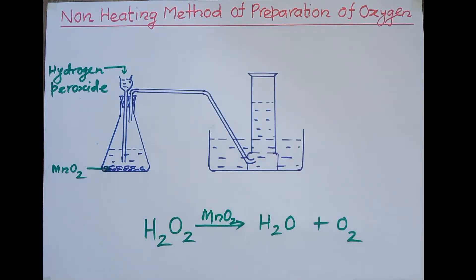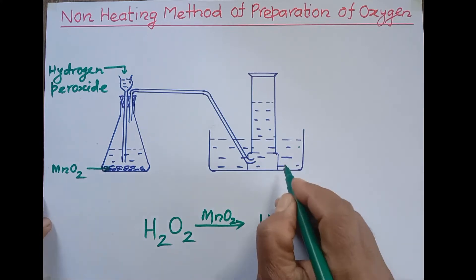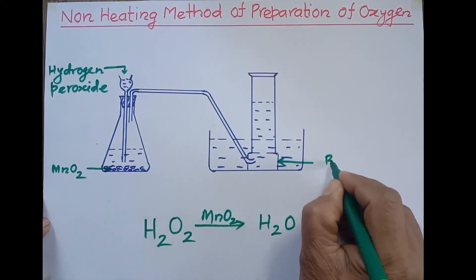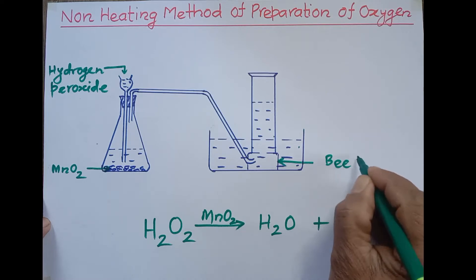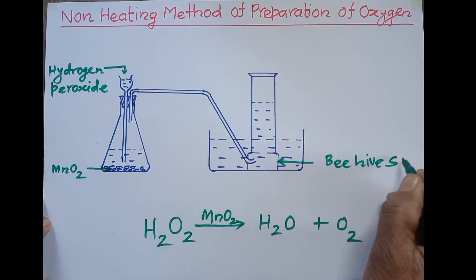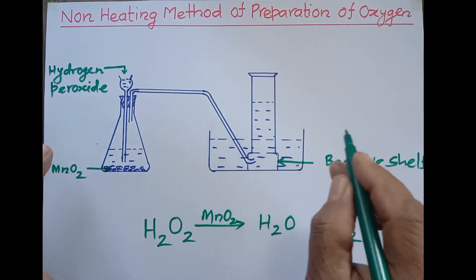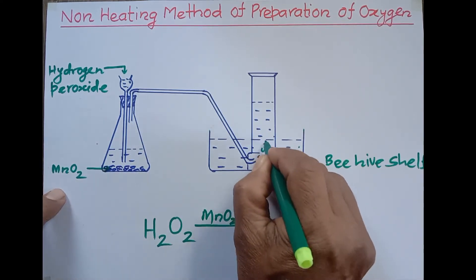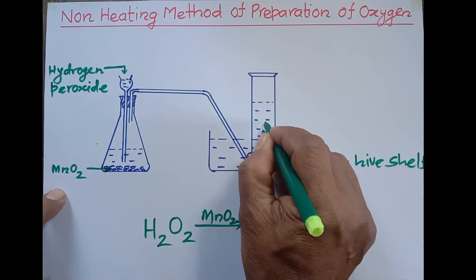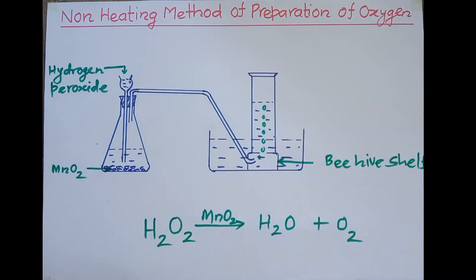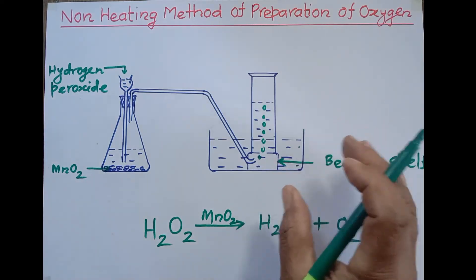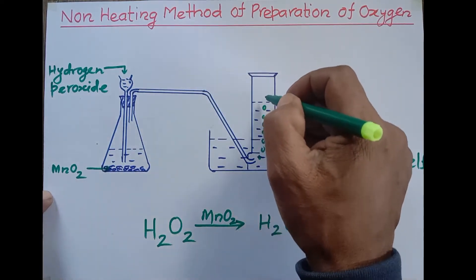The oxygen gas produced comes up and goes through this delivery tube. When it reaches this beehive shelf, oxygen is negligibly soluble in water and is lighter than water.